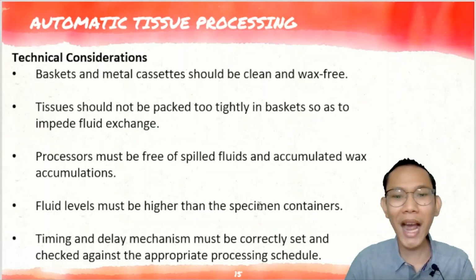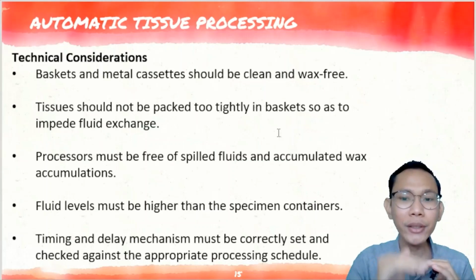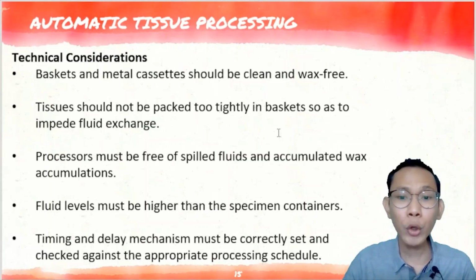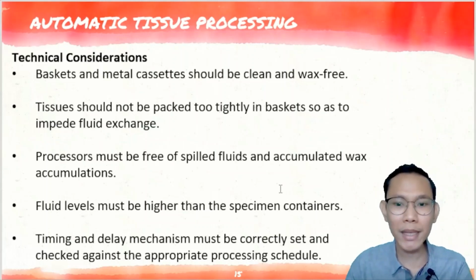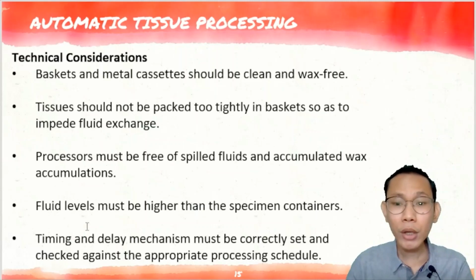Of course, kailangan yung fluid levels or yung reagent natin dapat higher than the specimen containers because we wanted to have a complete penetration ng ating specimen. Kasi pag mas mataas yung specimen container, of course, it will not fully penetrate sa ating tissue sample. Timing and delay mechanism must be correctly set and checked against the appropriate processing schedule.